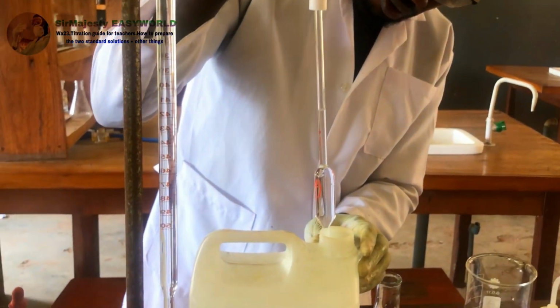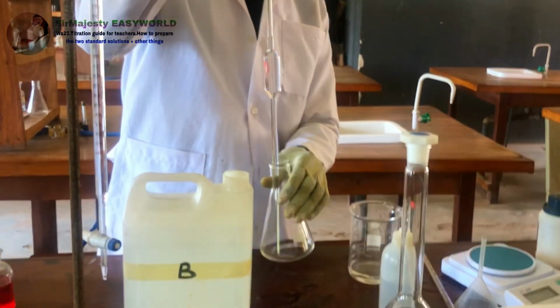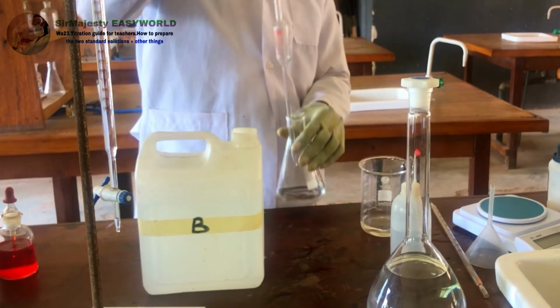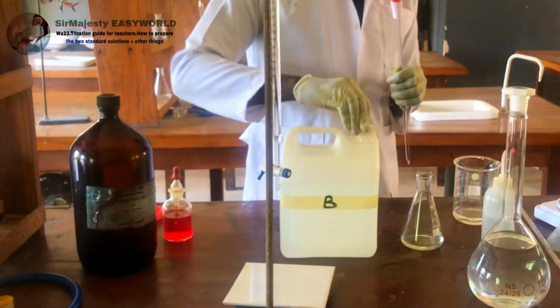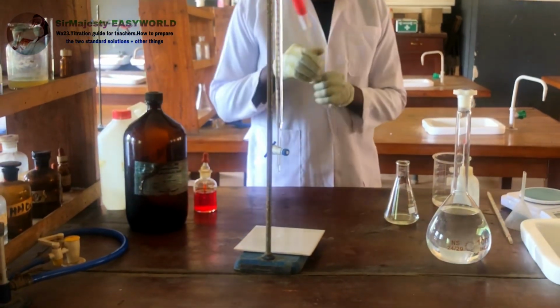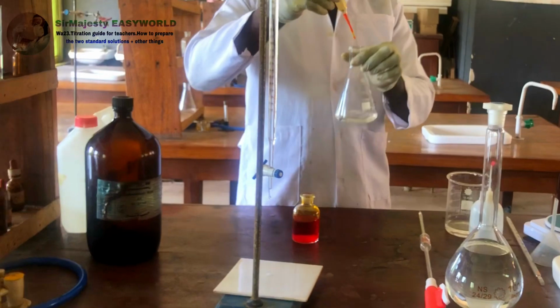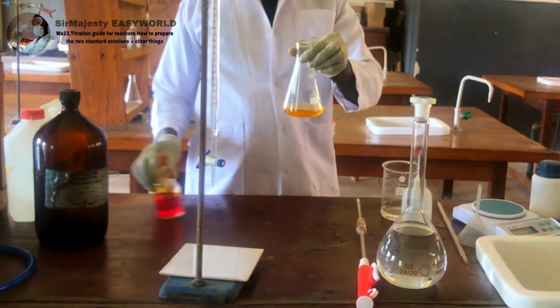Okay, that's it on the mark. So the dispense. This will siphon the liquid and also empty the pipette. A very simple and easy way. Okay. So what next? Keep this aside. My indicator before titration. Okay. That's it. There we go.